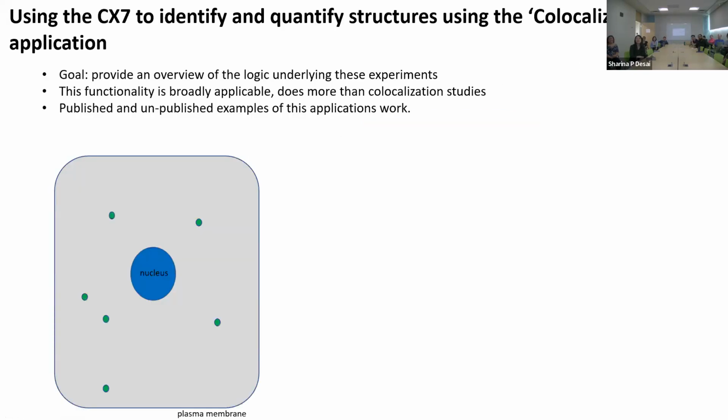What I'm going to talk about today are two different bio applications that I use as my bread and butter for the lab, really for most analyses. Some of these are not really what the bio application is designed for, but it seems to work the best for me and my knowledge base. And the one I use the most is the colocalization application.